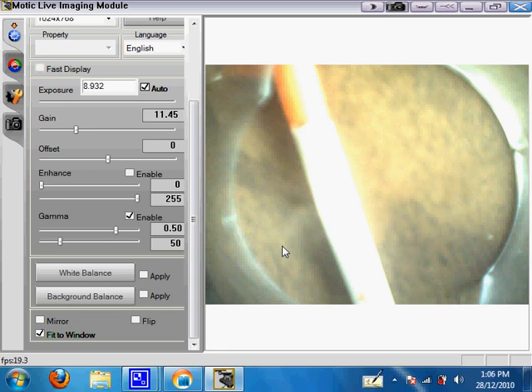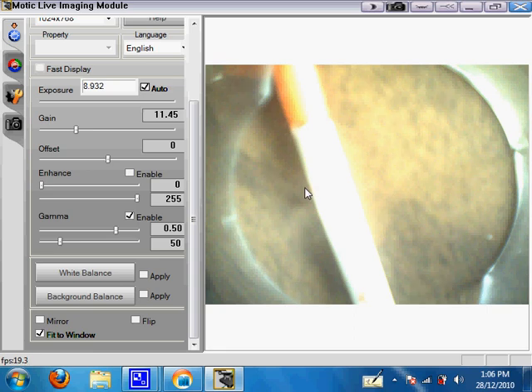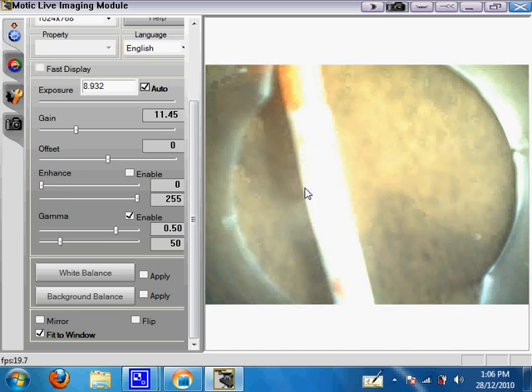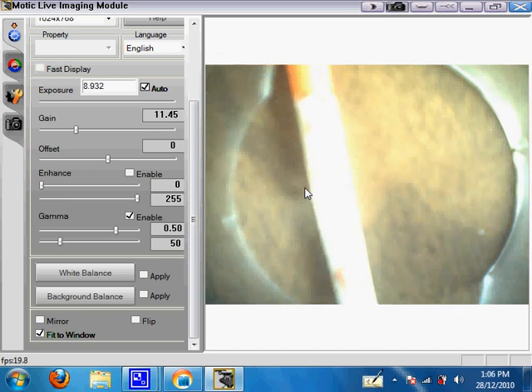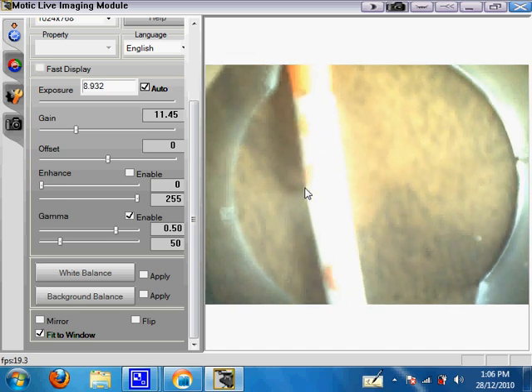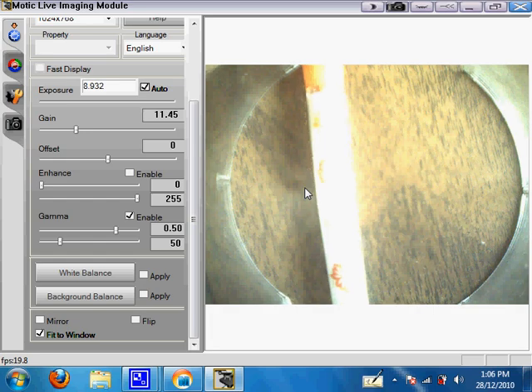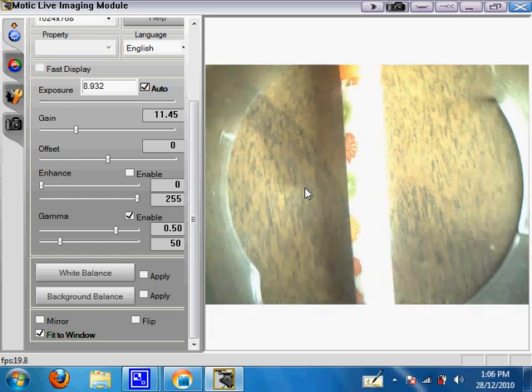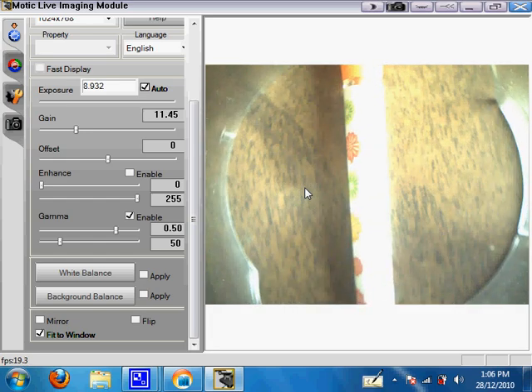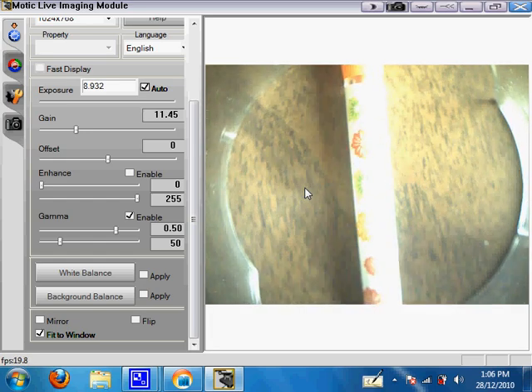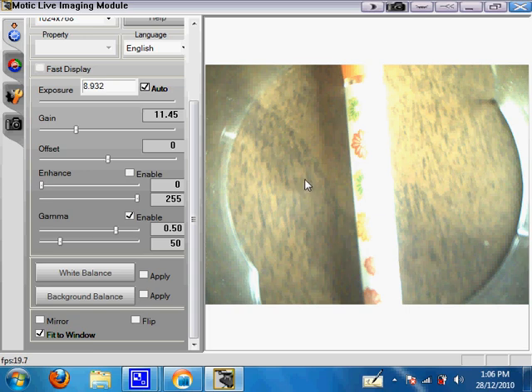As you can see, it's still overexposed and out of focus. What I need to do for the out of focus part is just to twist the 16mm lens to get into focus. Now that it's in better focus, I just need to check the exposure.